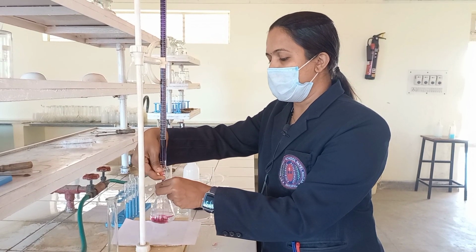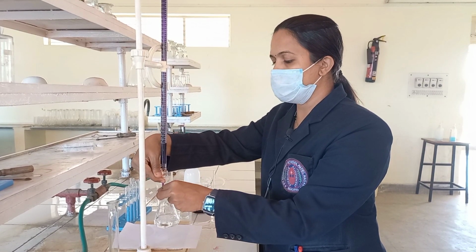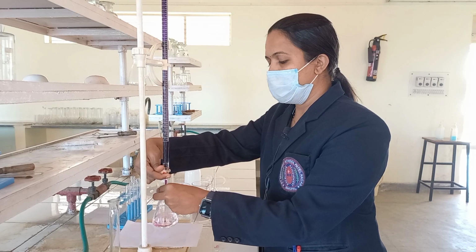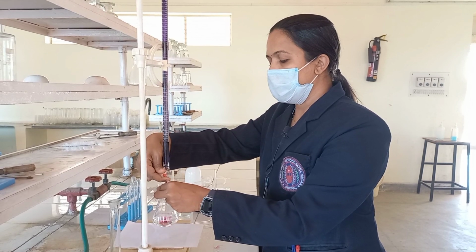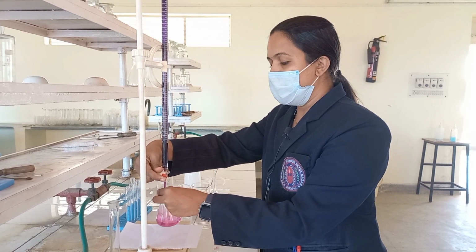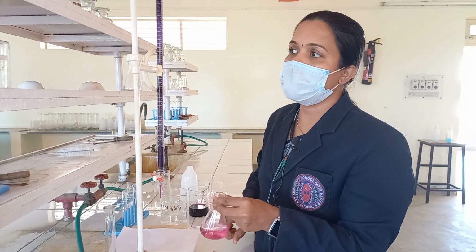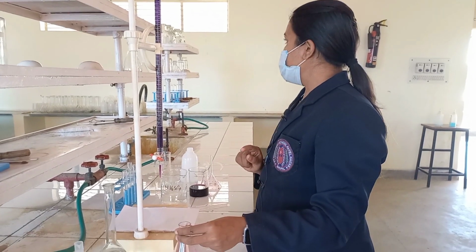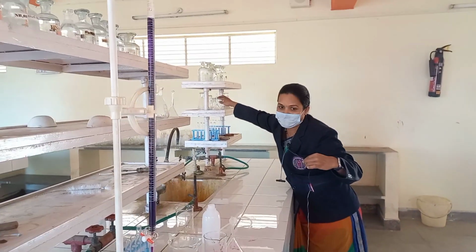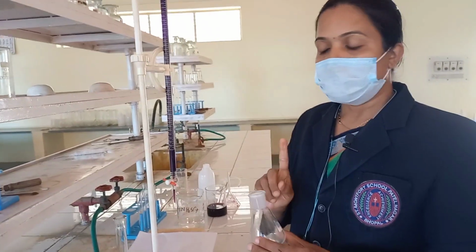So first of all you will pour the solution exactly about 1 ml, and then you will get to know what your first reading is. As soon as your solution turns from colorless to light pink, you can stop there. While adding this, beta, please be careful that your solution should be light pink. As it is the first time, you don't know where the exact reading will come. That's why it is a little bit dark, but I will show you one more reading in which you will get the exact light pink color.